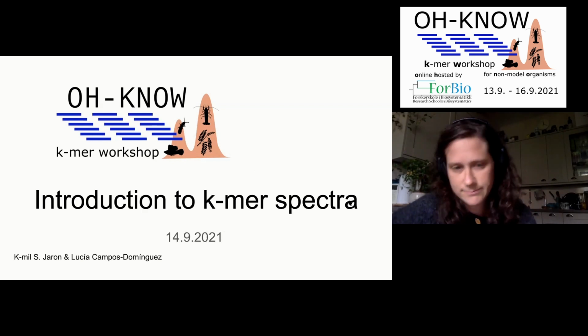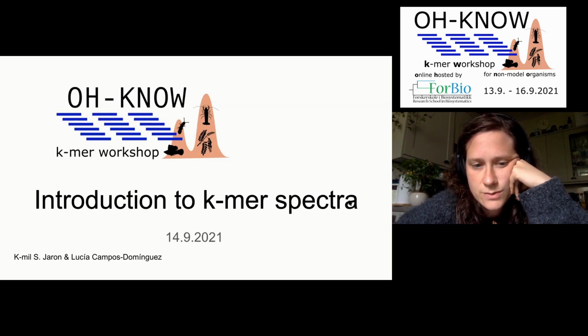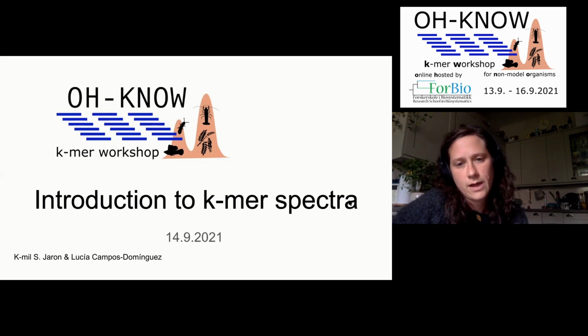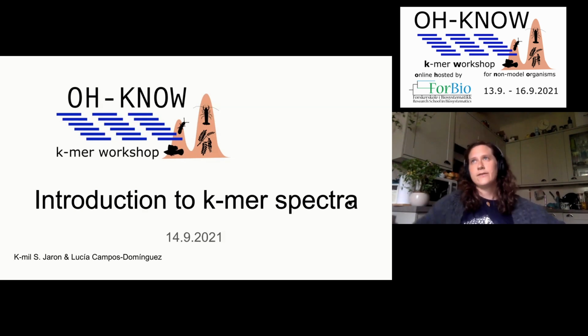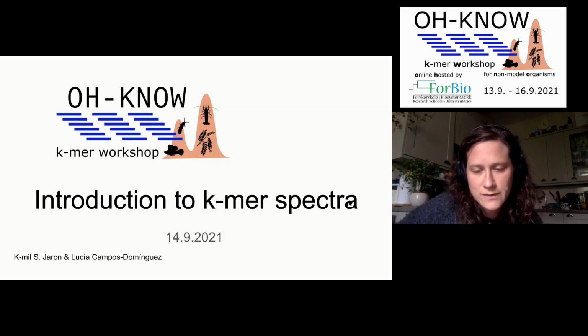Okay, so yeah, it's time to introduce everyone to the K-mer spectra. I know Kamil has been talking quite a bit about them, but what I'm planning to do with him in the next couple of hours is take you step by step on how the K-mer spectra is built, so it makes sense. I basically focus this presentation in a way that I would have liked someone to explain it to me in the first year of my PhD. So I was getting a bunch of genomic data and I was building these graphs and I had no idea what they meant for my species. Basically, that's the whole point of this.